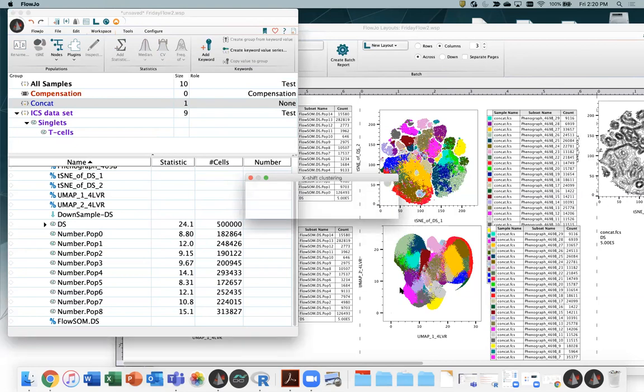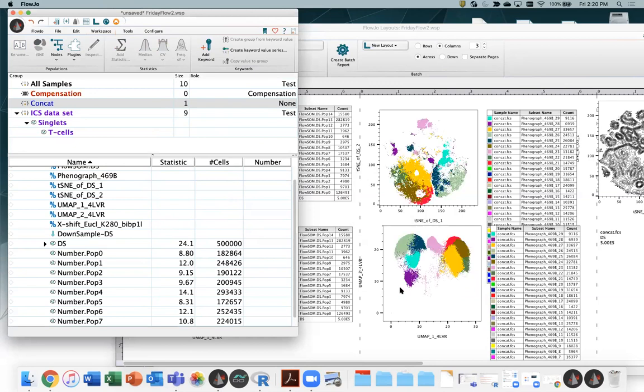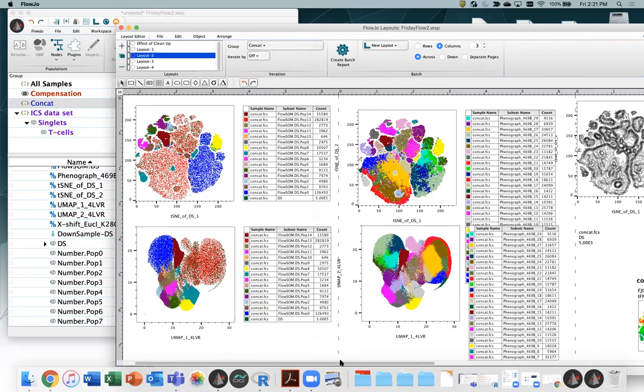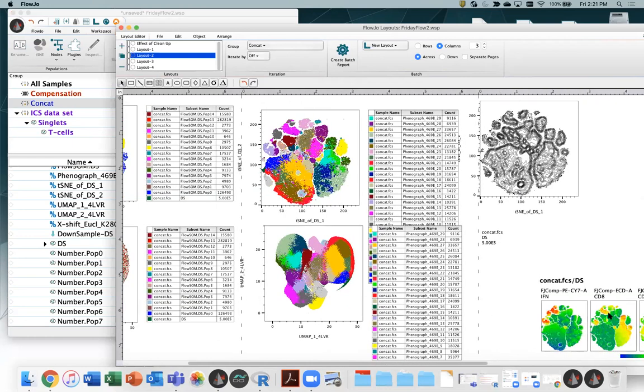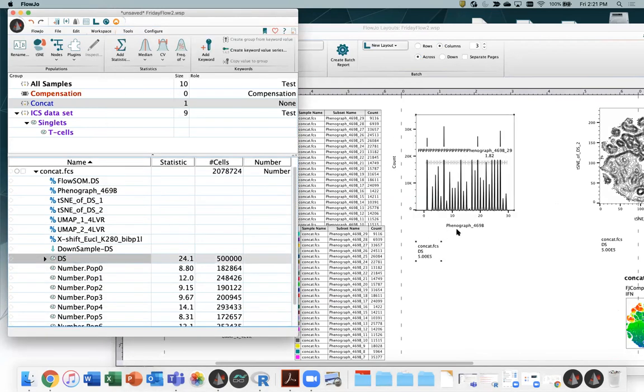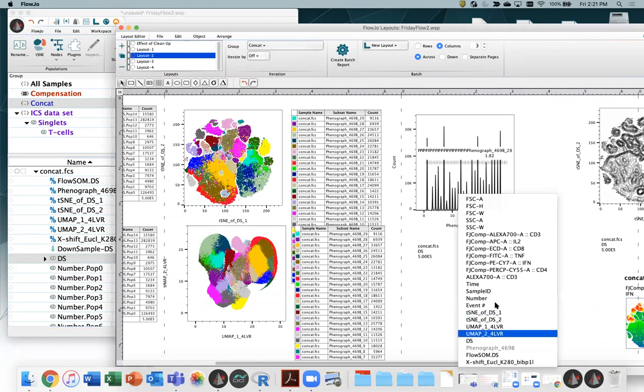And just a reminder too, again, X-Shift and Phenograph, that one's done. Both k-nearest neighbors density estimation based. The second pass of how it figures out the clusters is where they vary, whereas Phenograph is looking to make sure that you've got populations with lots of neighbors by default, and X-Shift is making sure that you've got local minima separating your maximums, your centroids. Moving that one farther over, dragging in downsample. Let's do t-SNE at the top.